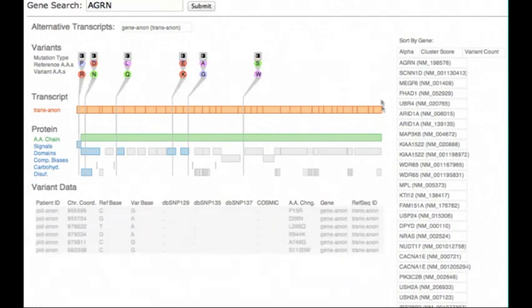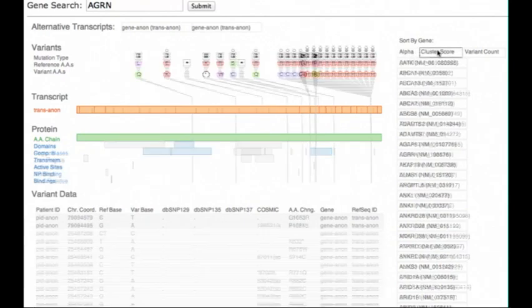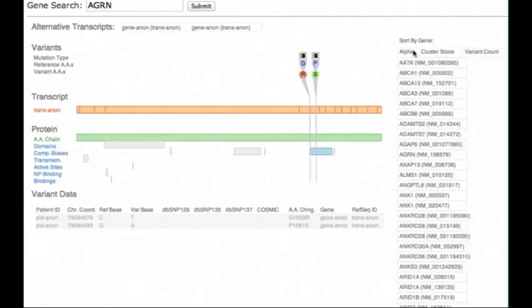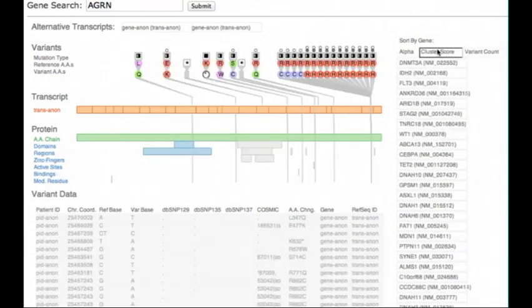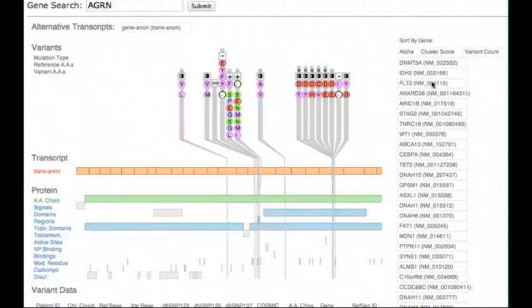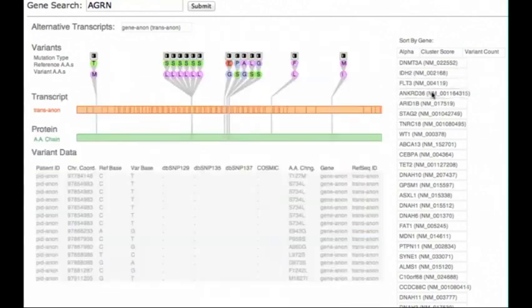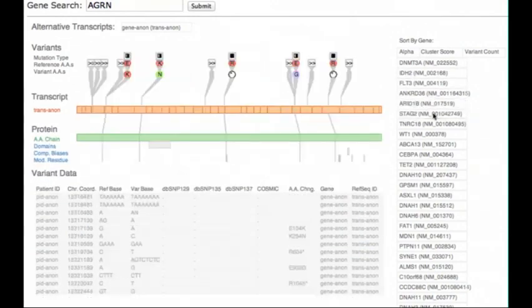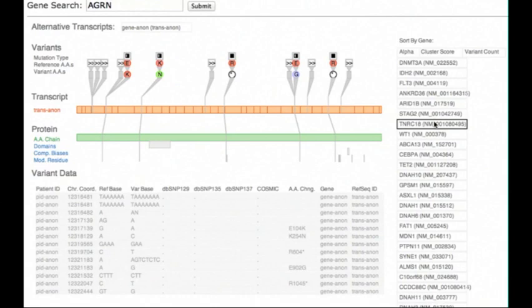VariantView exposes the information required for analysts to determine variant impact through carefully selected visual encodings and simple yet effective interaction techniques.